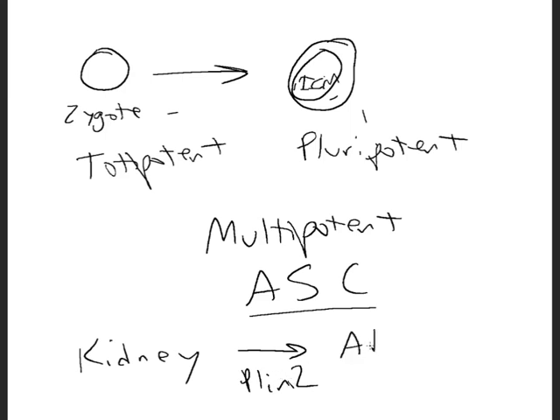And we were going to turn them into fat cells, or at least start making them behave like fat cells, turn them into adipocytes. Adipose tissue is essentially the tissue that will store triglycerides, and they do that by creating these lipid nodules, these areas that can store the fat.